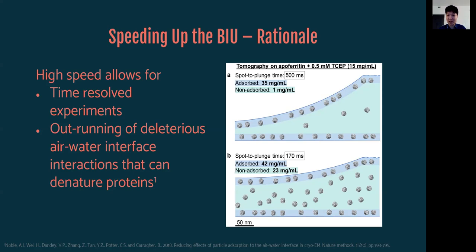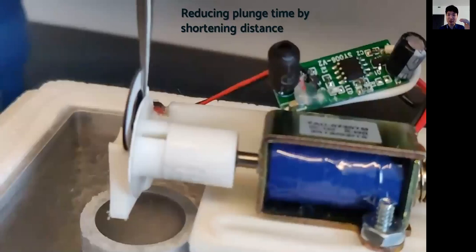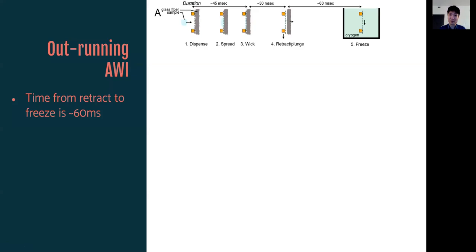So in order to test how fast we can speed up our device, we actually use a hemagglutinin trimer sample, which was also used in their paper. This sample actually adopts a preferred orientation view when it sticks to the air-water interface, so it's very telling. Only when it's not at air-water interface can you see side views of it. One way to reduce the plunge time is that we actually shorten the distance between the grid when the sample is applied as well as the cryogen, so that it has less distance to travel before it's plunged. Here you can see that. It only needs to plunge at a really short distance before it hits the cryogen, so it's as close as it gets.